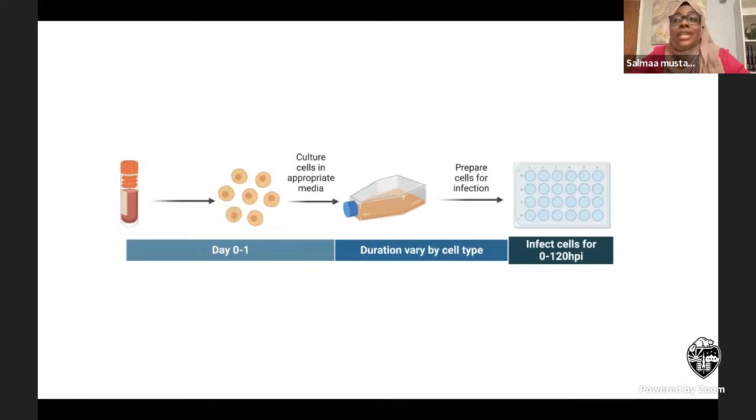That could take you several weeks, to get to the point where you know, okay, BHK really grows really fast. At what point would I stop them, or would I infect, so I don't just go through infecting them when they're overgrown? That's the very first step that you need to establish for all the cell lines.